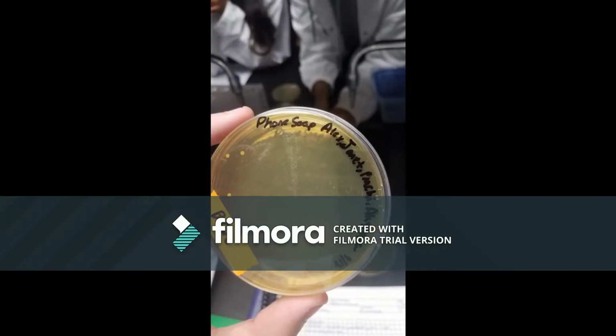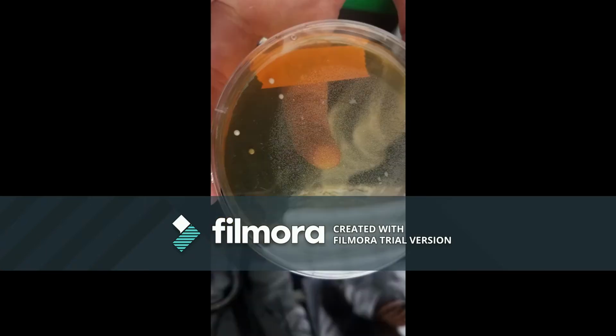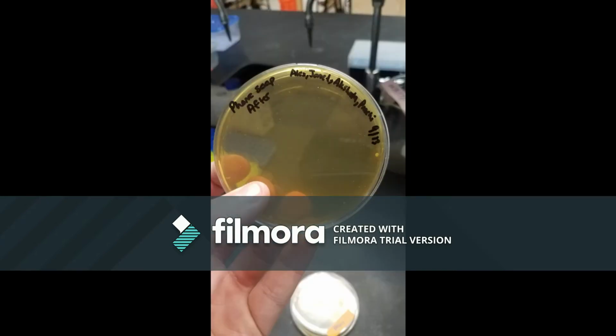The before PhoneSoap plate had 4 colonies of bacteria on it, and the after plate had 1 colony of bacteria. The PhoneSoap device was capable of removing 75% of the bacteria found on the phone.